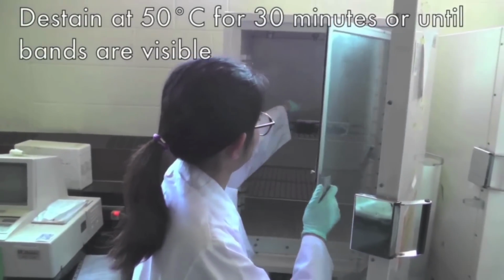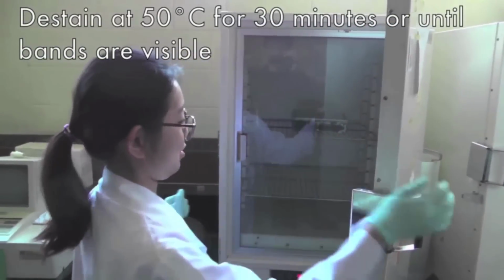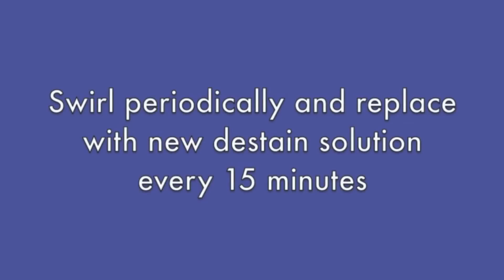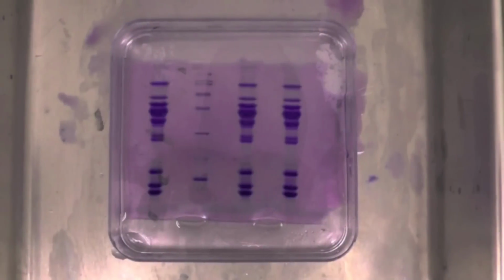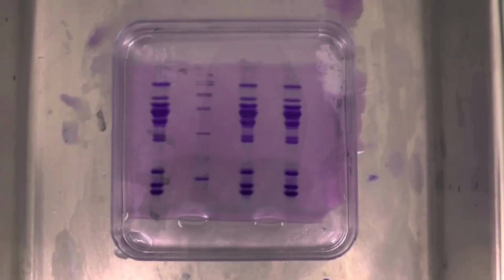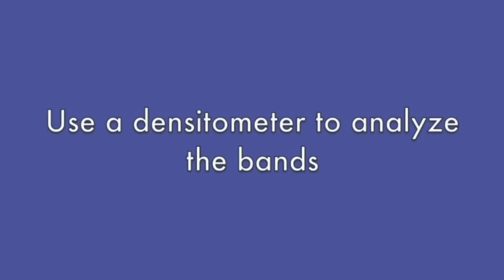Destain at 50 degrees Celsius for 30 minutes with periodic swirling to facilitate the destaining process. You may also want to change the destaining solution every 15 minutes until the background of the gel is transparent. When the destaining is complete, store the gel in DD water until you can scan and analyze it with a densitometer.